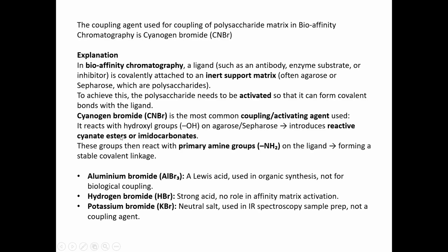So these groups then react with primary amine groups on the ligand, forming the stable covalent linkage. So this is why cyanogen bromide is used.